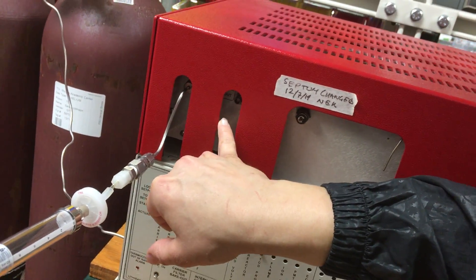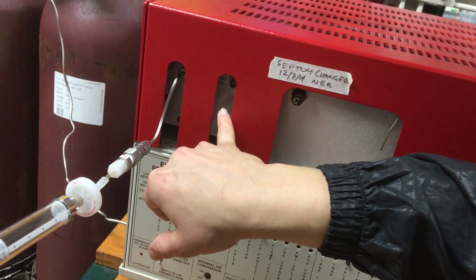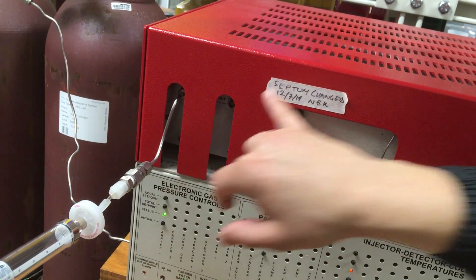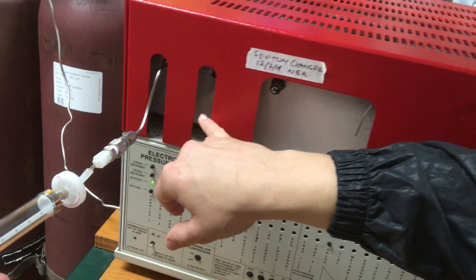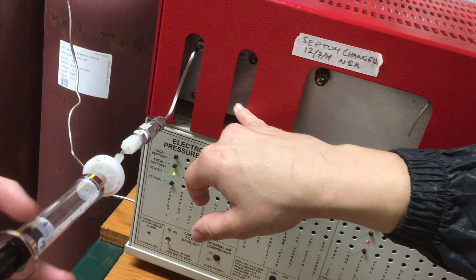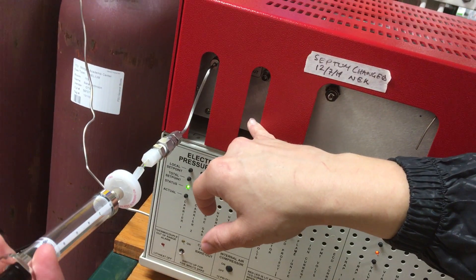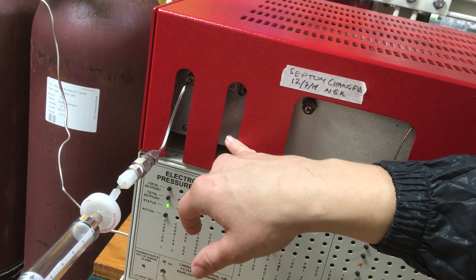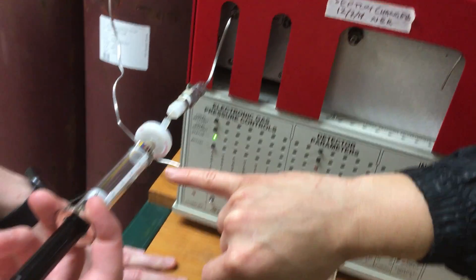And so we recommend flushing it with 10 fold the amount that the 1 milliliter loop can hold, because if we only put the 1 mill in it, it's possible it'll be contaminated with air or whatever previous sample might be lingering inside of that loop. And so that's why we have so much going in.